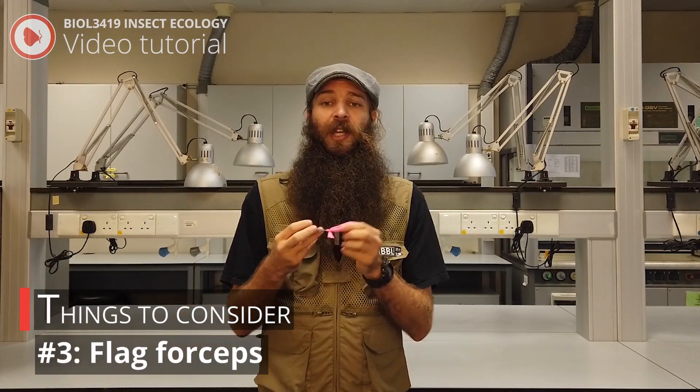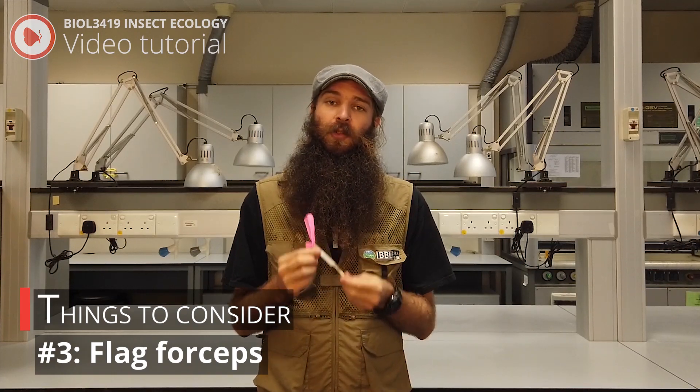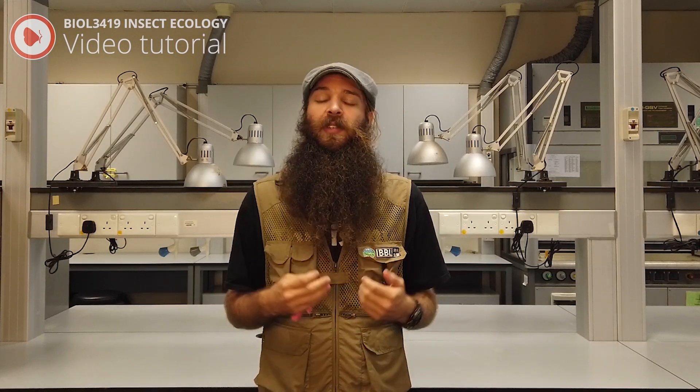Three, all forceps should have a flag at the end. This is so you can easily spot them if you drop them in the field. And finally, both of these methods require dexterity. The more you practice, the better you'll be at it. Thank you and happy collecting.